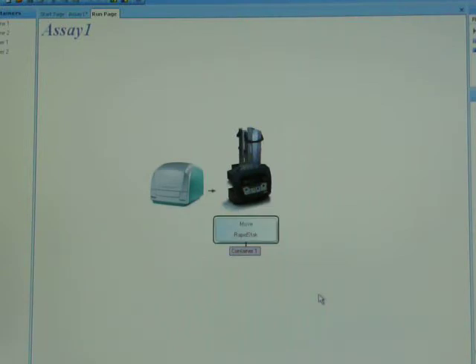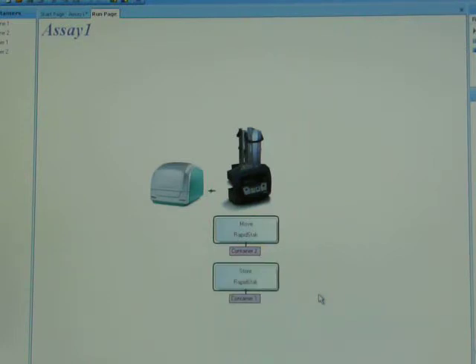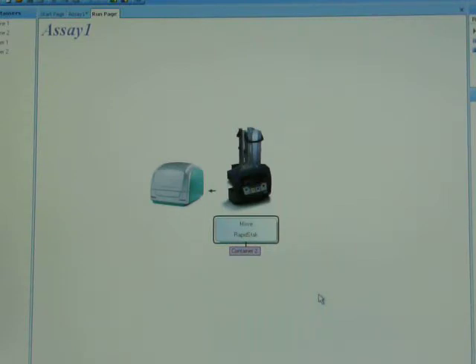You can see it's moving the plate on the screen back to the RapidStack. It's now storing container 1 into the BackStack, and now it's picked up container 2.